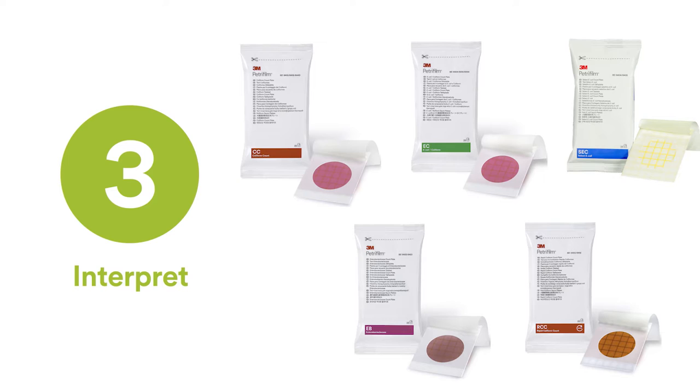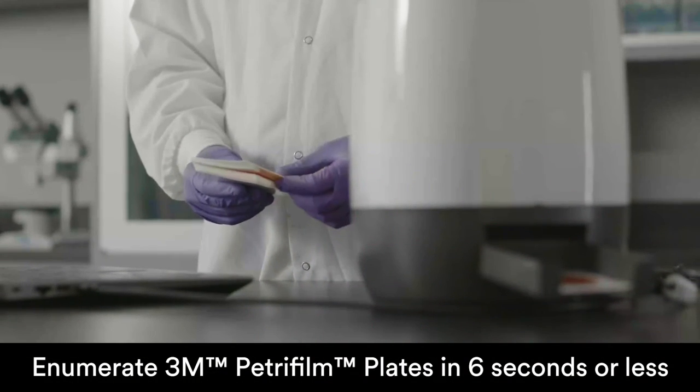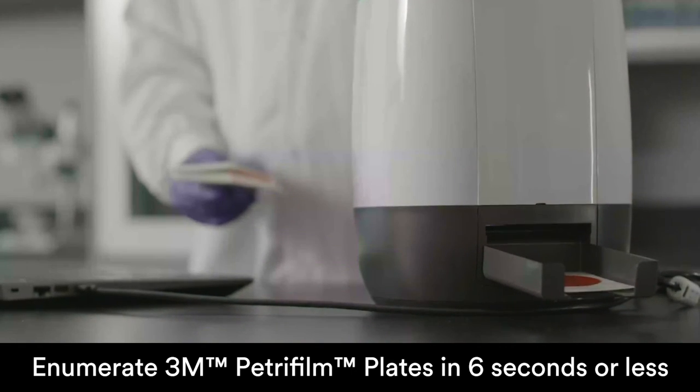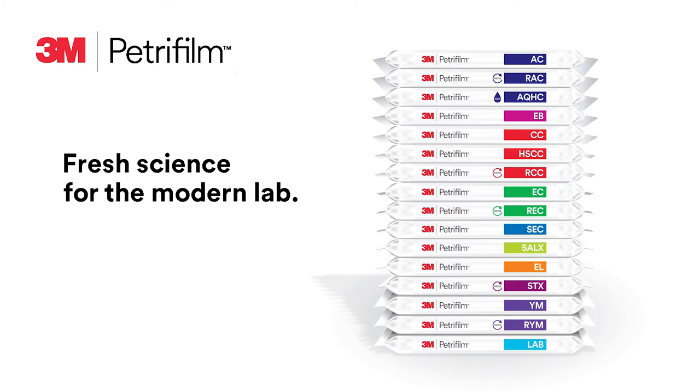Step three: interpret. With the 3M Petrifilm Plate Reader Advanced, your lab's technicians can enumerate 3M Petrifilm plates in six seconds or less, while maintaining the accuracy of a trained microbiologist.